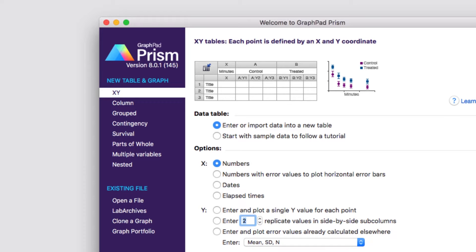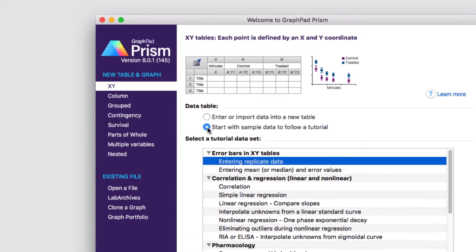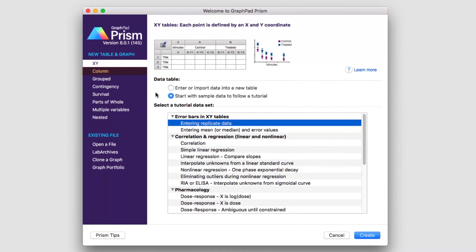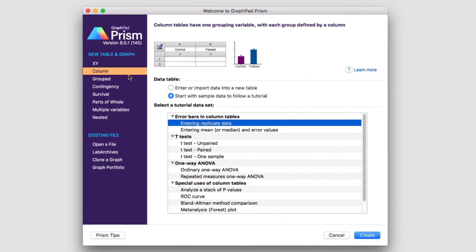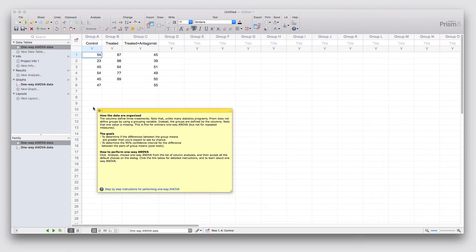Each of the data tables in Prism comes preloaded with a set of tutorial data that you can use to understand how the tables are structured and how to perform different analyses within those tables. To access the tutorial data sets for any of the data tables, simply select the data table that you'd like to work with, and then choose the option Start with Sample Data to Follow a Tutorial. We're going to start by using the tutorial data set for an ordinary one-way ANOVA under the Column Data Table. Clicking Create brings up the project file and shows you the tutorial data.